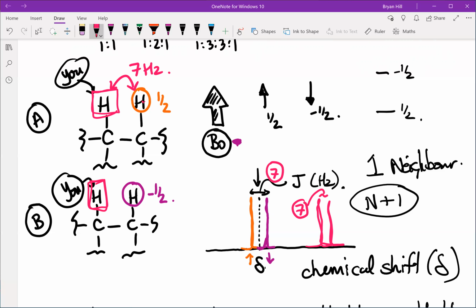It's actually used to determine, like some protons are coupled by a number of different other protons, so you can actually link, okay, this one's coupled to this one at 5 and this one's coupled to this one at 4, or whatever it might happen to be.